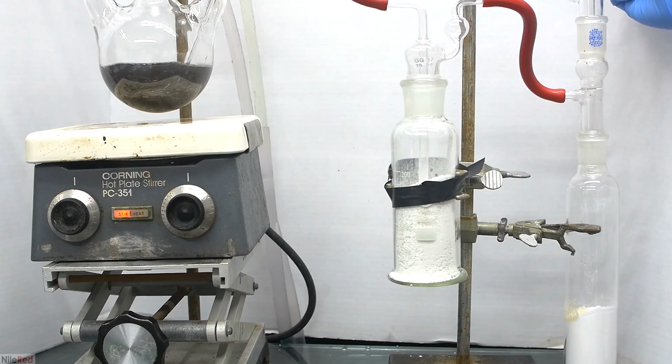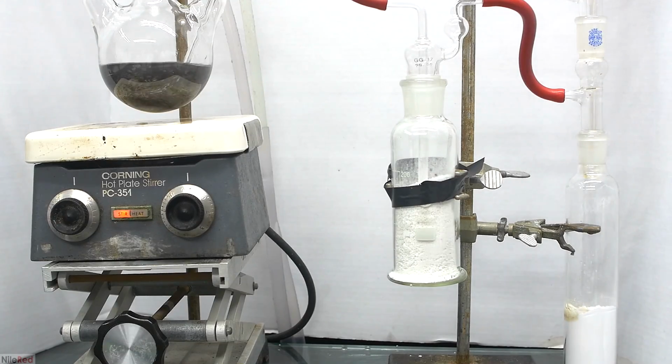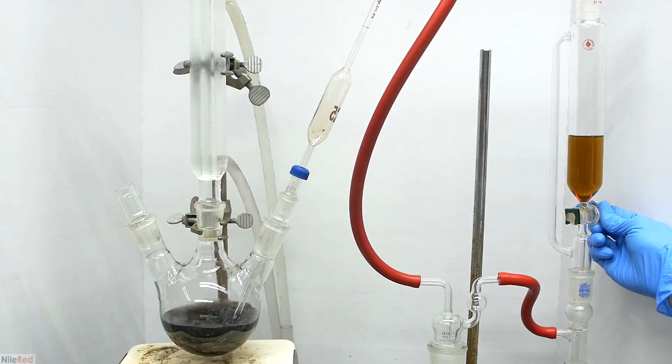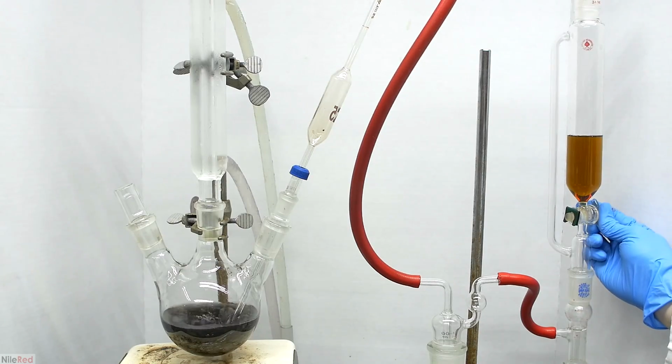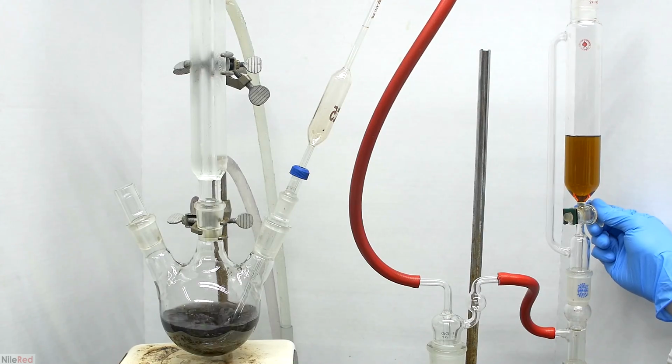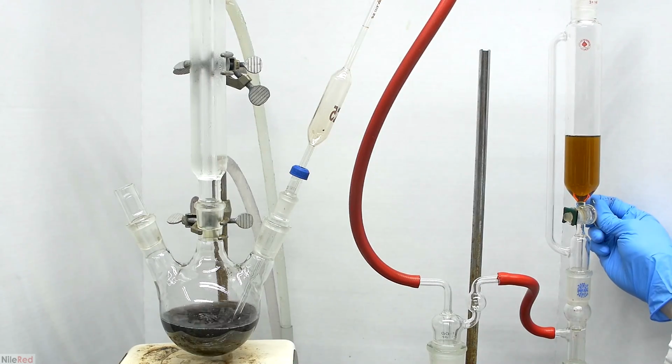I turn on the stirring, and I start generating CO2 gas by mixing the sulfuric acid with the sodium carbonate. It's important here to add the sulfuric acid slowly because we don't want to overload the system and overpressurize it. If too much gas is generated, we might pop one of our fittings apart, and this is obviously something we don't want to do.